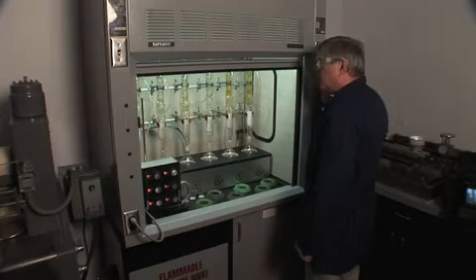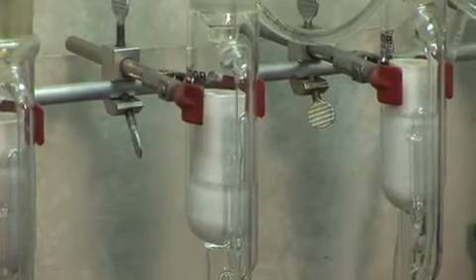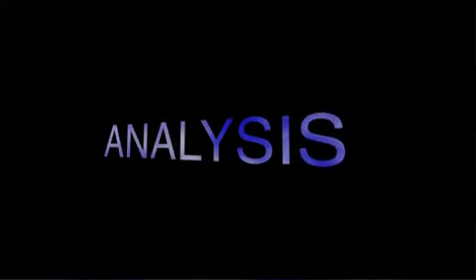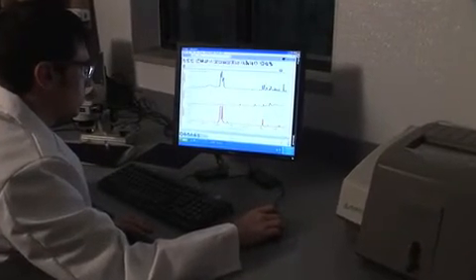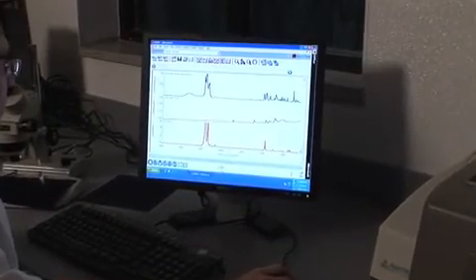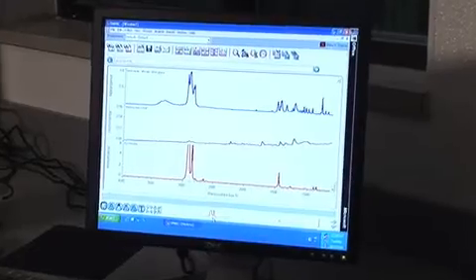Extractions. This test determines the amount of oils or spin finishes contained within a yarn or on a gray fabric. Fourier transform infrared analysis. This equipment measures absorption or reflectance of organic products at different wavelengths. The data provides DNA-type information on raw materials for both quality control of chemicals and analytical research.